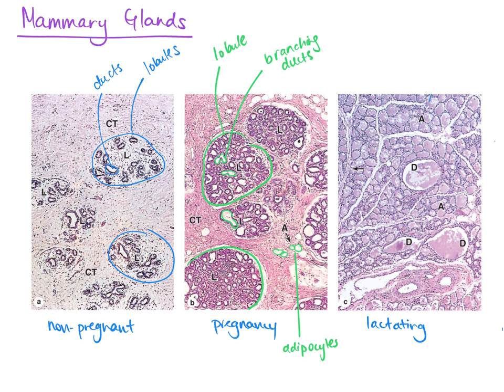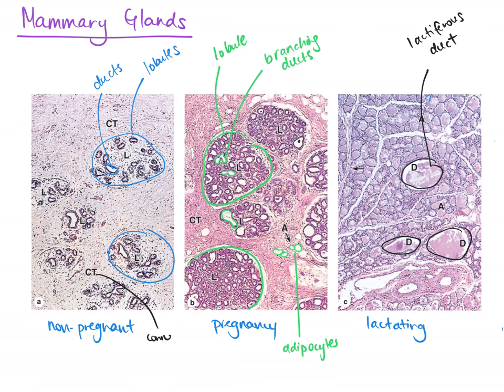Moving on to the image on the right: the lobules have become really large because we're now looking at breast tissue of a lactating breast post birth. The lobules have become large mainly because the alveoli and ducts are now being filled with this pink substance, which is the milk. As we go from left to right — non-pregnant to pregnant to lactating tissue — connective tissue is clearly reducing, and is only sparsely available in the far right lactating breast image, compared to the first image where we can see the term 'CT' all over.